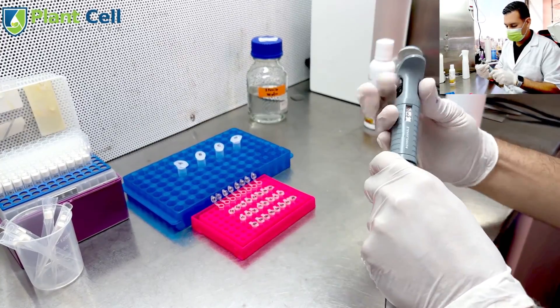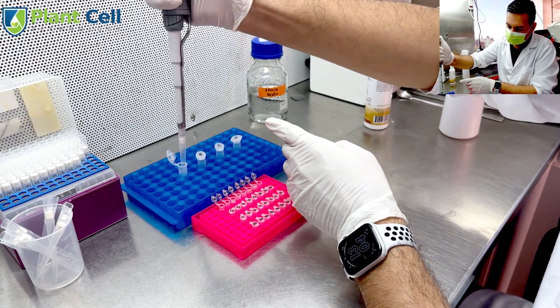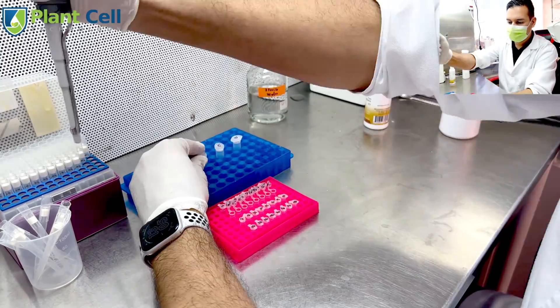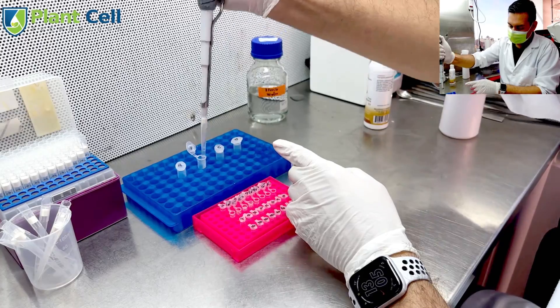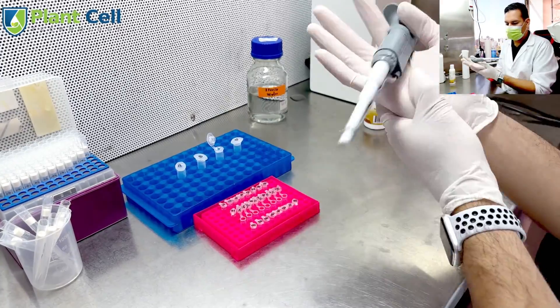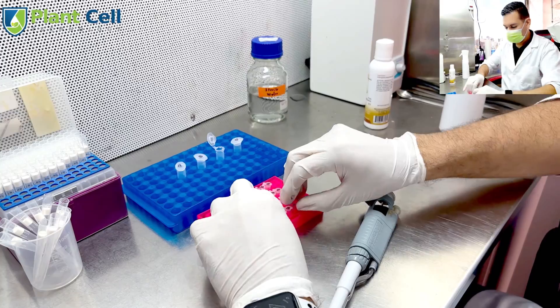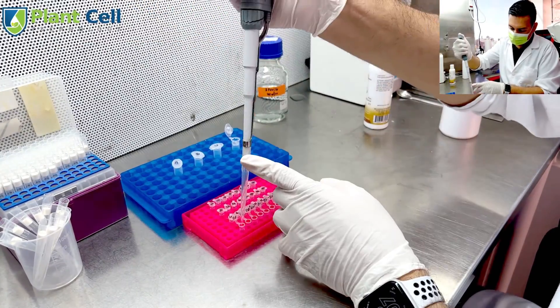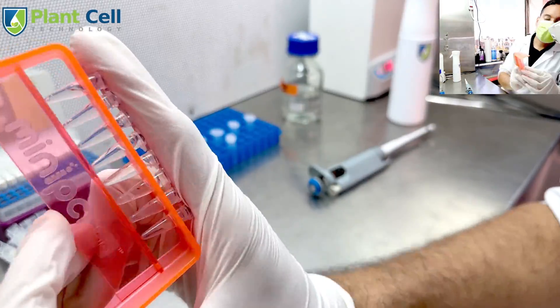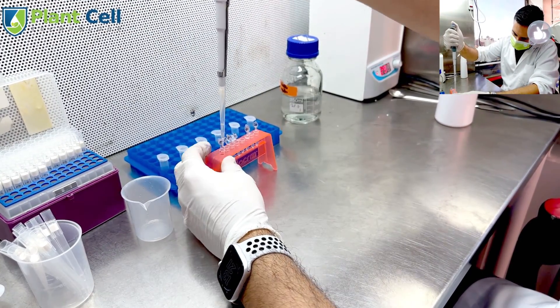I add the sterilizing solution to each tube using my micropipette — 0.2 milliliters of the hydrogen peroxide solution to the first set of tubes, 0.2 milliliters of sodium dichloro to the second set, and 0.2 milliliters of hypochlorous acid to the third. I start with the solution that needs the most time: hydrogen peroxide takes just over an hour, sodium dichloro around 40–45 minutes, hypochlorous acid around 30 minutes, and bleach — the strongest — only 12 minutes.